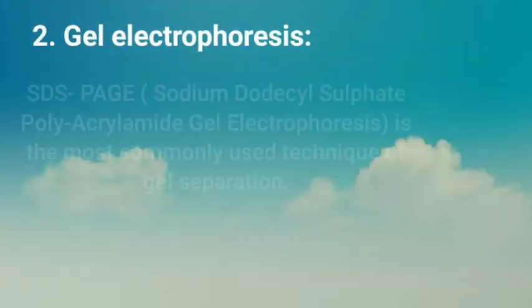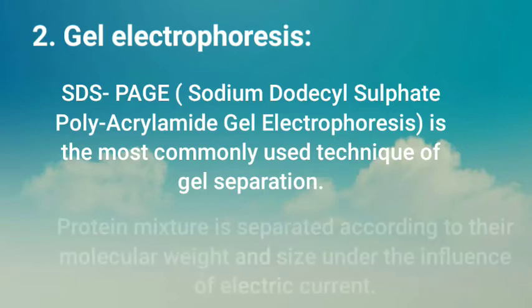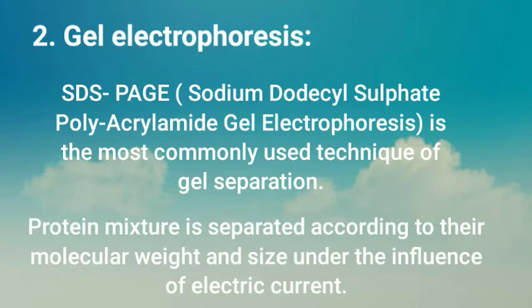Second step is gel electrophoresis. SDS-PAGE, sodium dodecyl sulfate polyacrylamide gel electrophoresis, is the most commonly used technique for gel separation. The protein mixture is separated according to their molecular weight and size under the influence of electric current.